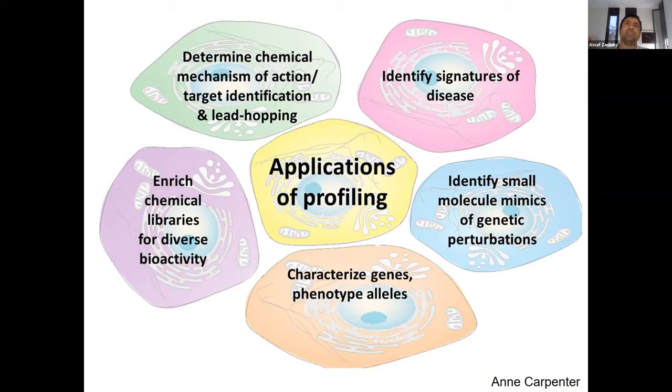Well, that's true, but the assumption of similarity between the appearance, the morphology, and the molecular composition of a cell and its function is quite common. And in screening, this is just the first step in a long pipeline that starts with screening all of these molecules, for example, and eventually getting to one drug from many thousands or millions of molecules. So if we find something interesting here, it will need to be validated later, which might fail, but it might work. And there is a strong correlation between the appearance of a cell and its function, which gives some support for this intuition. So we still need to be aware of that.